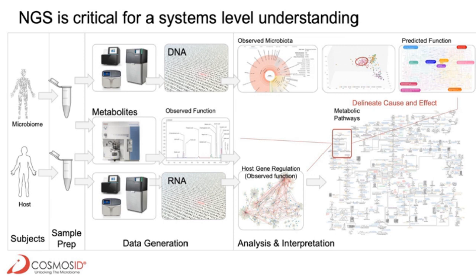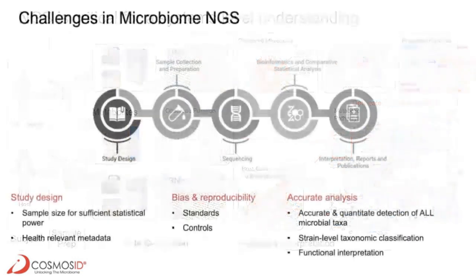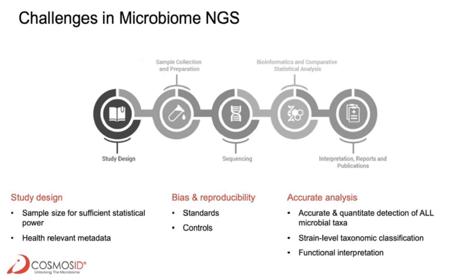Similarly, we also need to measure the numerous ways hosts are responding to their resident microflora and identify novel proteins and pathways mediating such interactions, so that we could delineate cause and effect and identify druggable targets. Apart from these, we also experience additional challenges throughout the entire microbiome sequencing and analysis workflow.